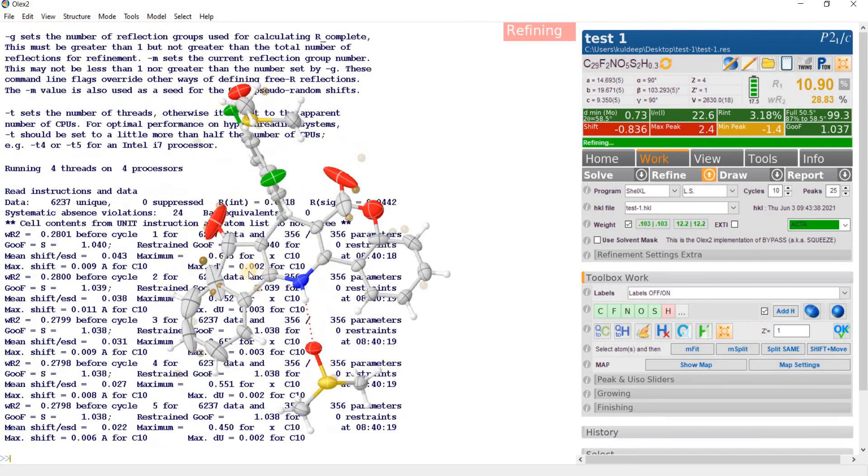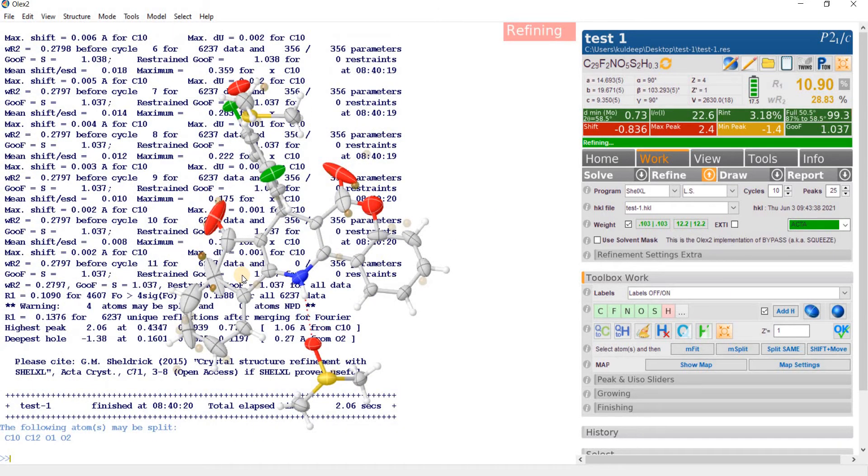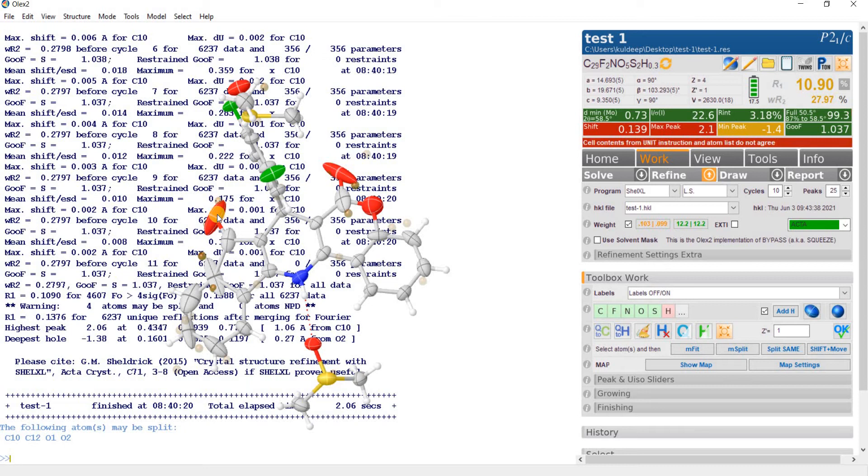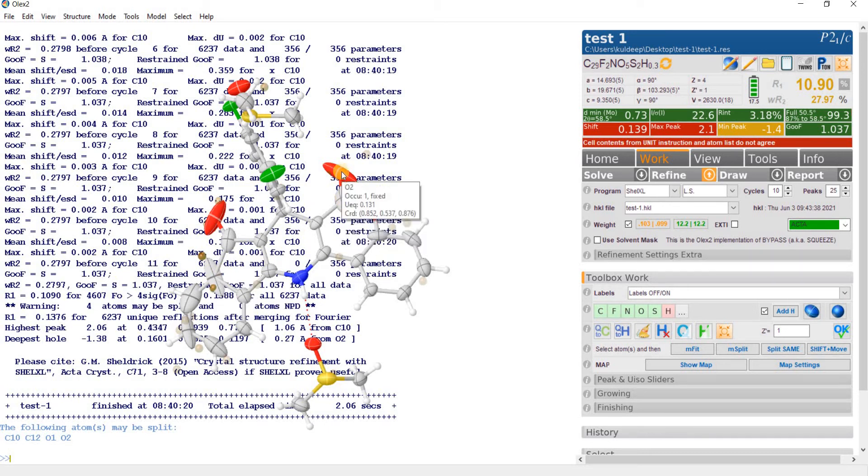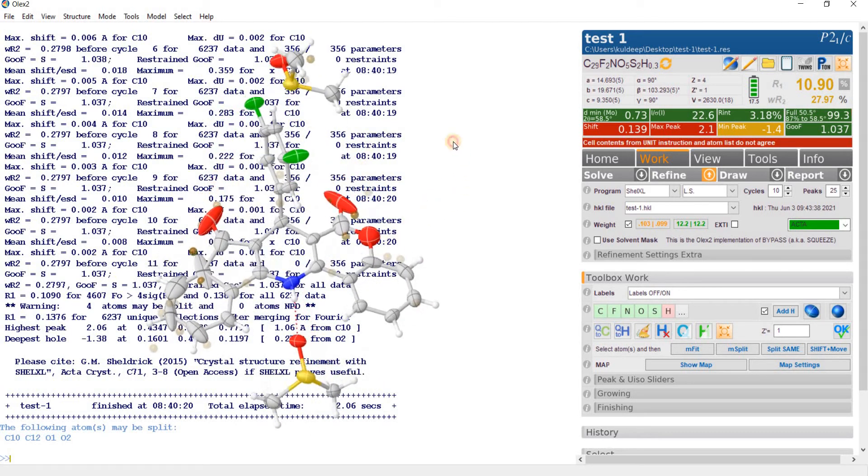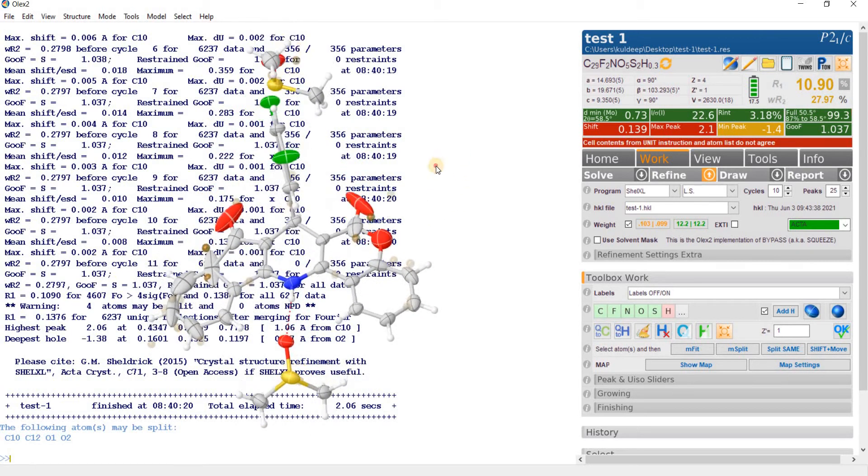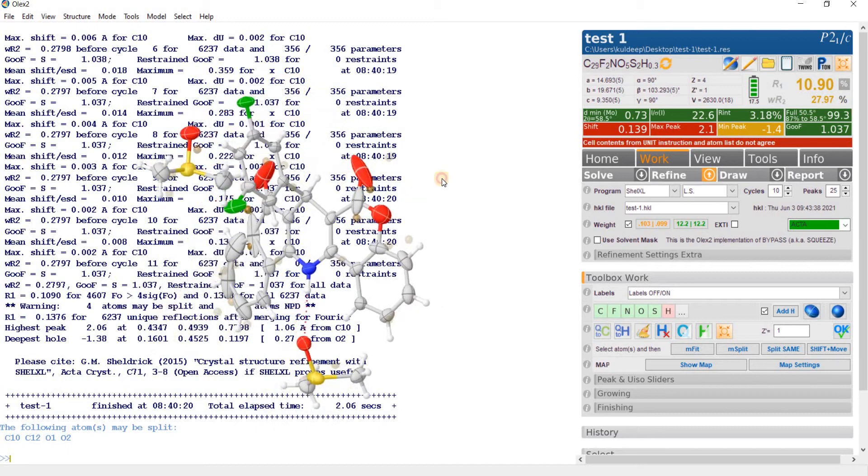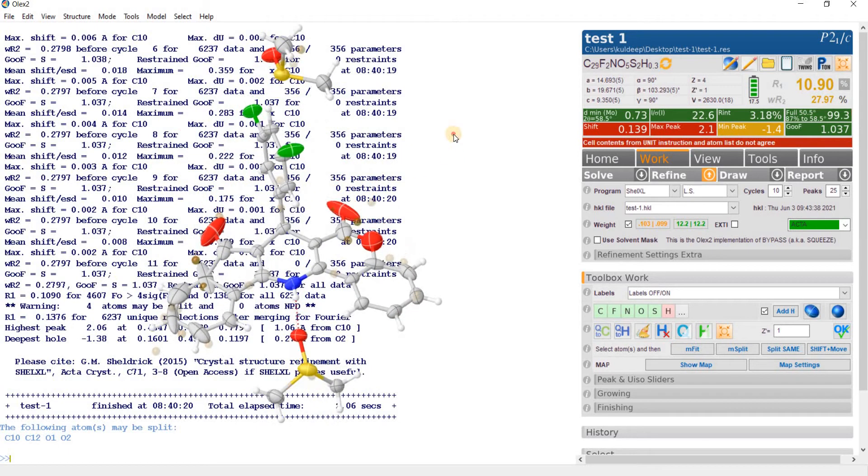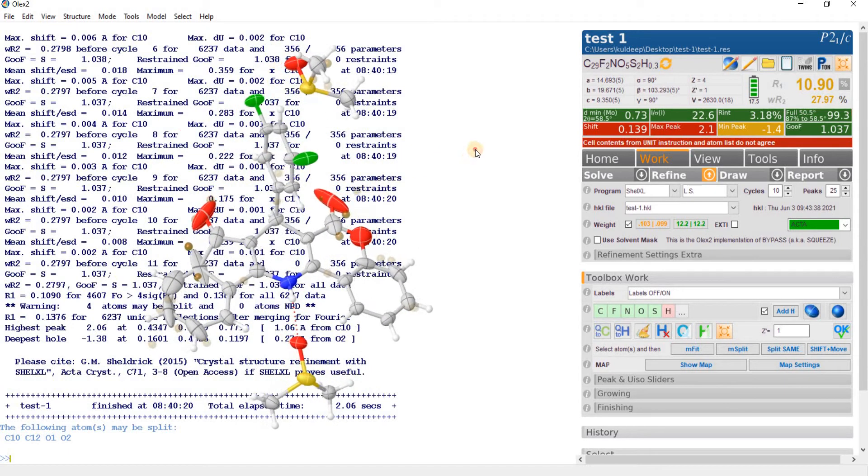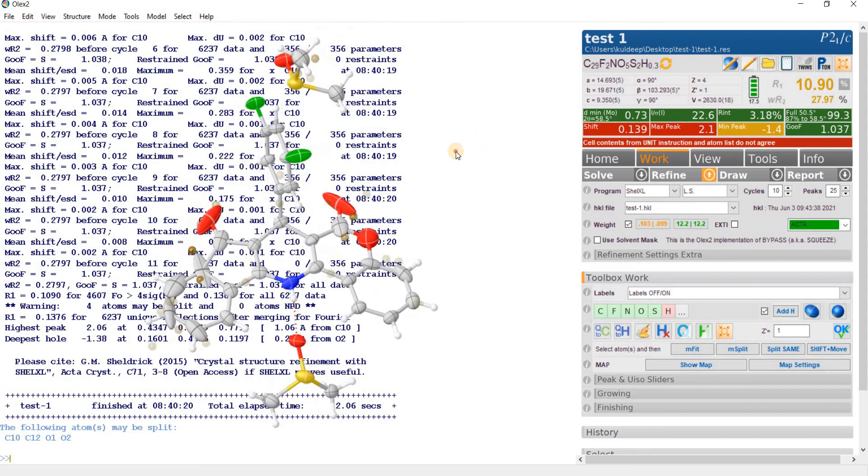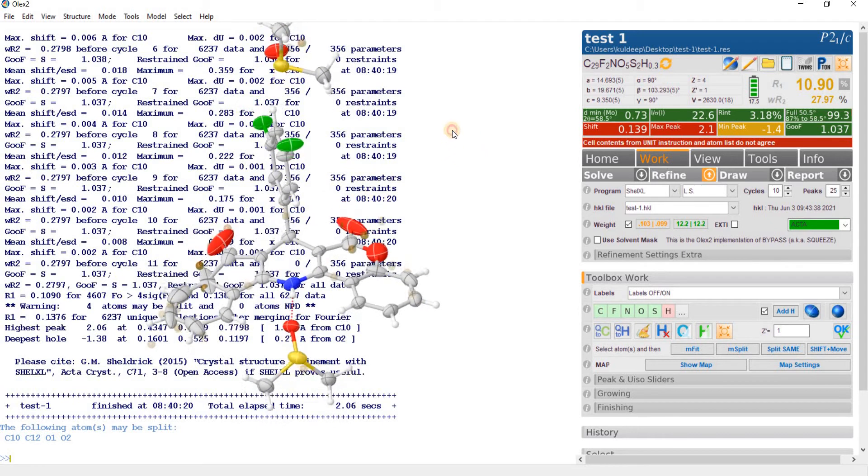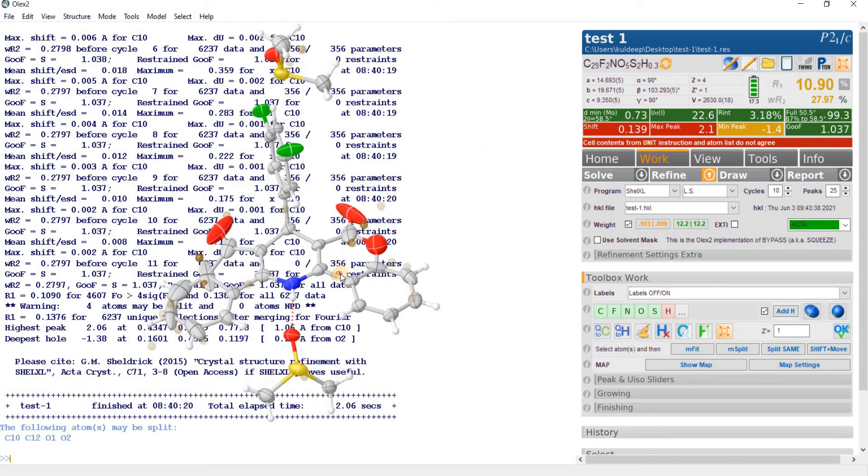And also we observe that certain atoms like O1, C9, C10, O3, C19, Oxygen 2, O2 are not in the good shape. The thermals are not behaving normally and this is due to the disorder in the molecule. Actually, the major fraction of the molecule is showing a disorder.